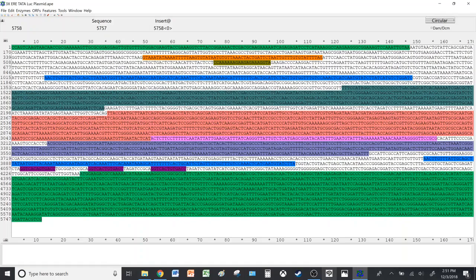In this video we will discuss the finding tool for open reading frames, or ORFs, as well as translating the sequence present in the plasmid to give you the protein or the amino acid sequence that results from translation. So let's get started with the open reading frames.